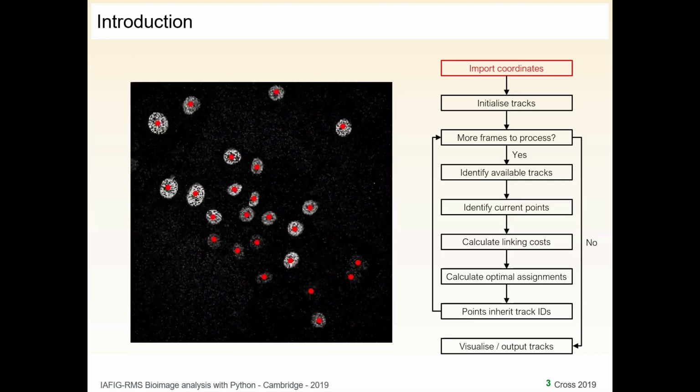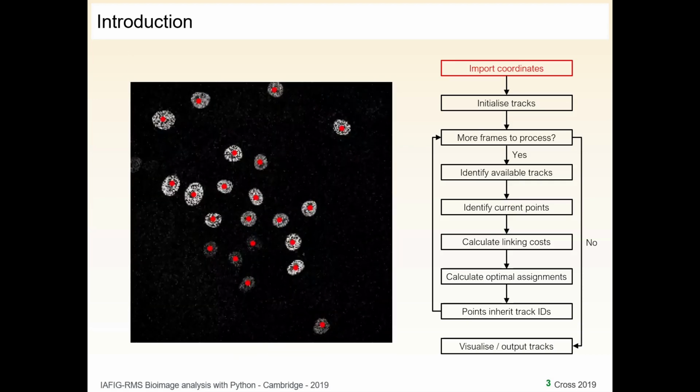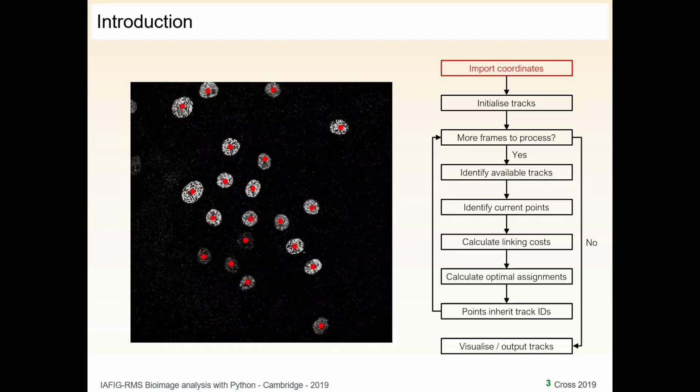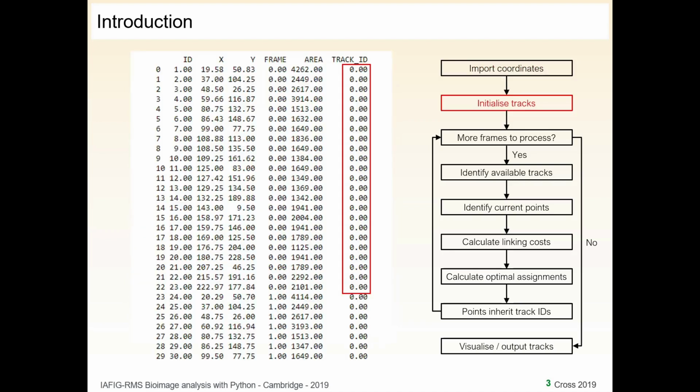And you've already seen this video, but this is just the centroid coordinates that we've received from the Cell Tracking Challenge plotted on top of a small section of the video that we've received.